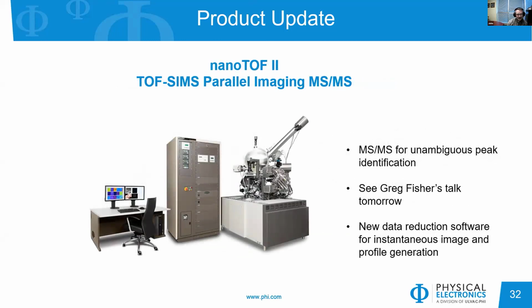And finally, on the TOF-2, we have MS/MS for unambiguous peak identification, and Greg Fisher will be giving a talk tomorrow on how this works as well as some applications.